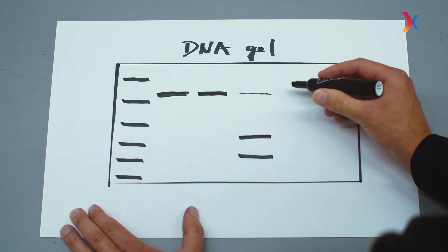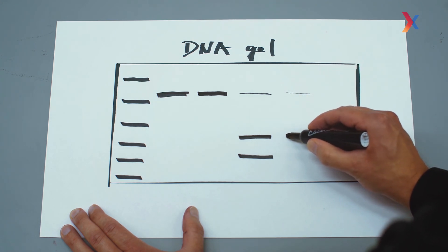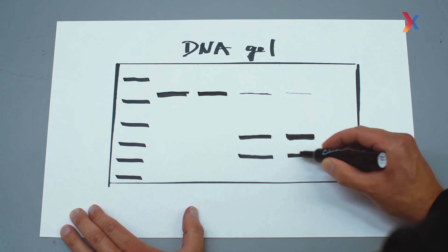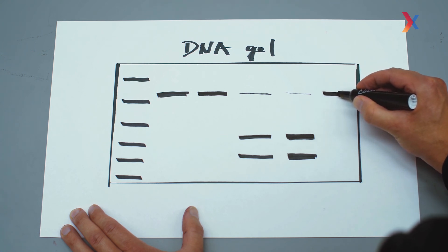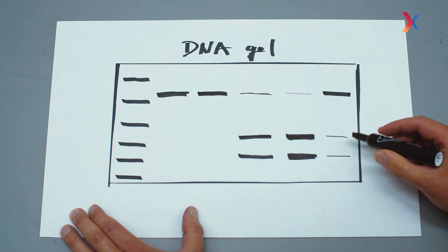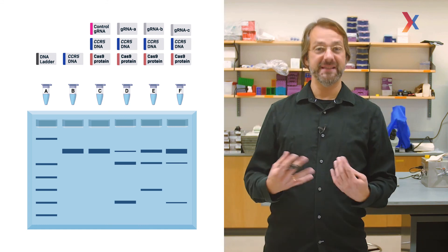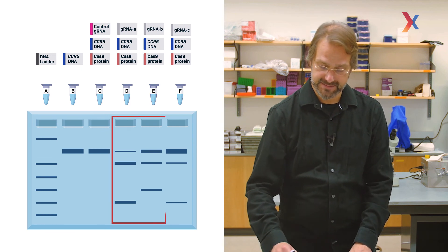Guide RNA A seems to work pretty well. Guide RNA B seems to be even more effective because we lose even more of the full-length uncut DNA and generate even more of the two CCR5 fragments. Guide RNA C, on the other hand, doesn't really seem to be working well — most of the DNA remains uncut and only a tiny amount is fragmented. So if we want to choose the two best guide RNAs, we would choose guide RNAs A and B.